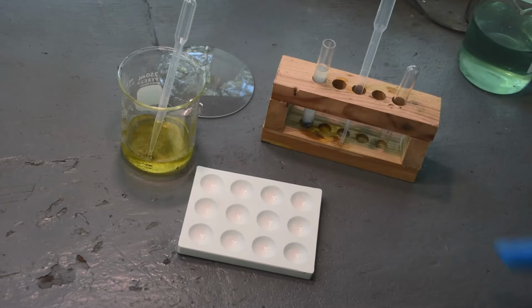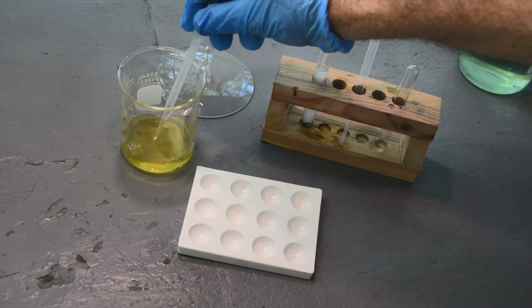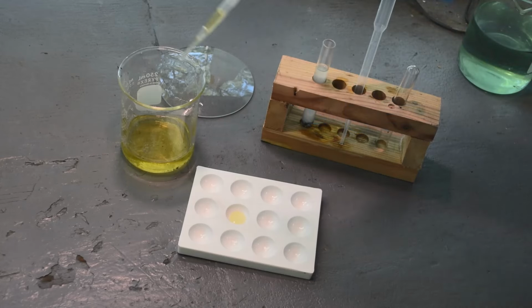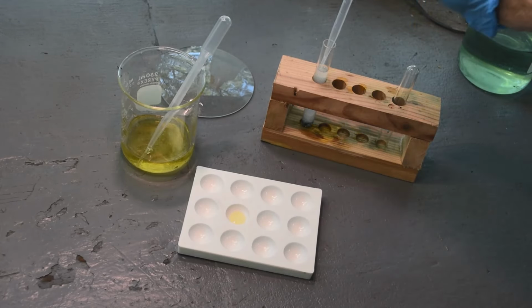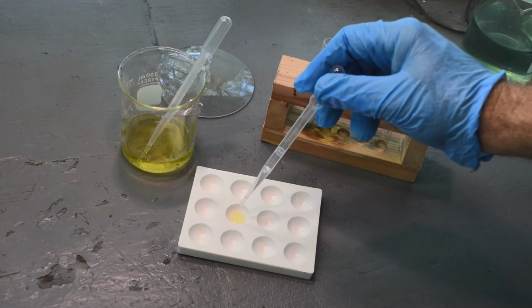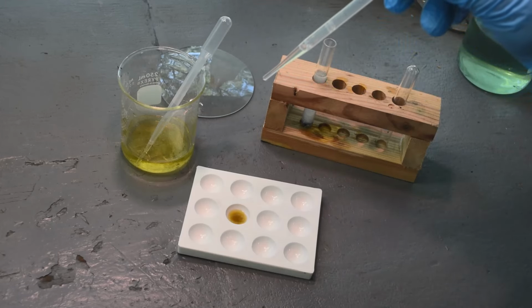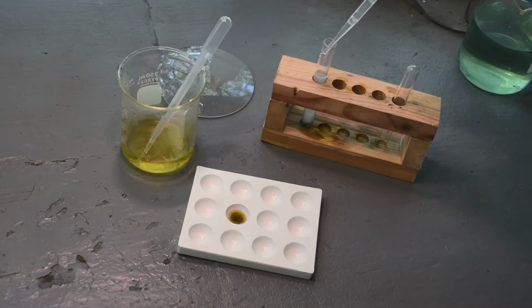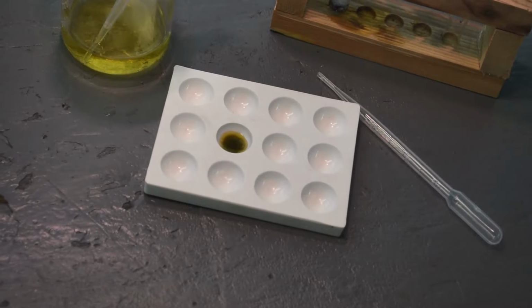Alrighty, so let's do a stannous chloride test on this very suggestively colored liquid here. Let's see what we've got. We'll put a little bit in this spot plate. I've got some very, very fresh stannous chloride solution here. Just made it. So let's see what happens here. Oh my. Did you see how orange it went? It went orange, and now it's going green.